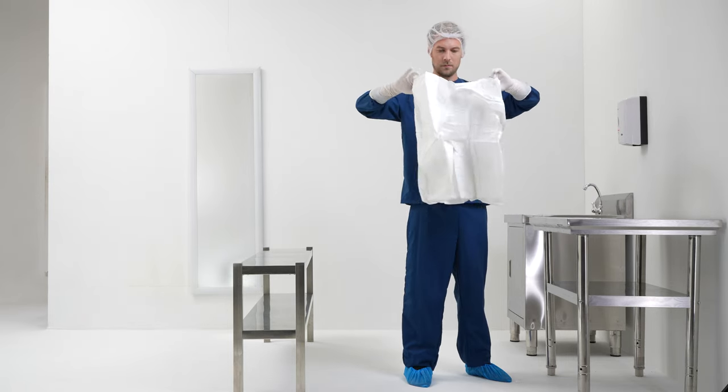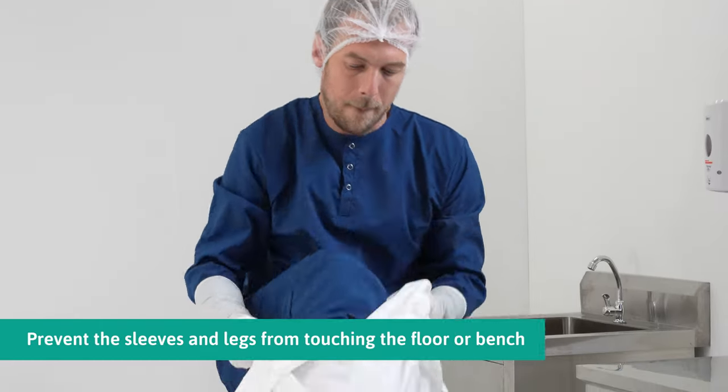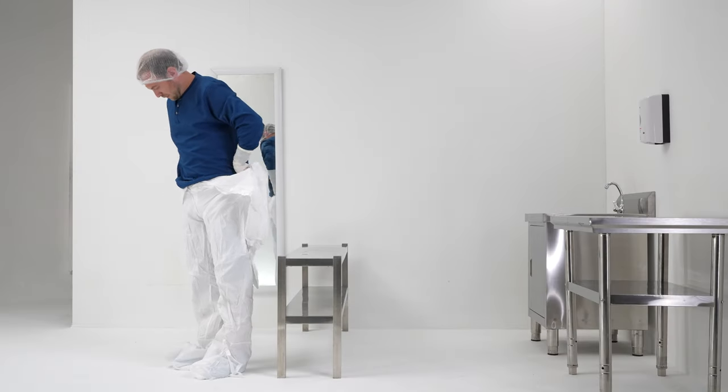Grab the coverall at the waist area. Insert one leg into the coverall and place the donned leg at the white zone. Repeat with the other leg.